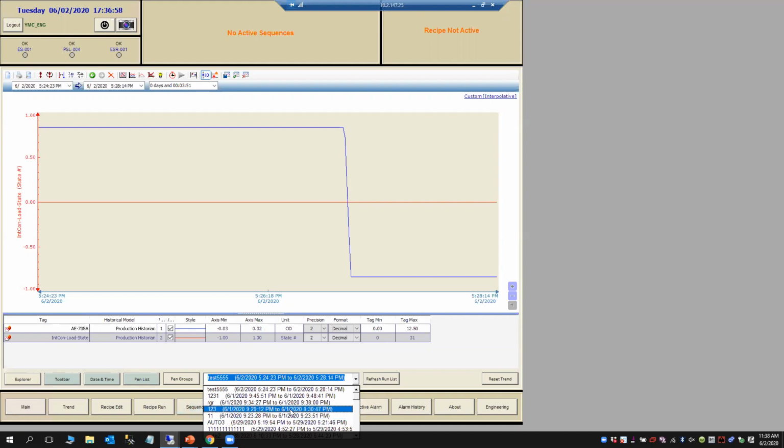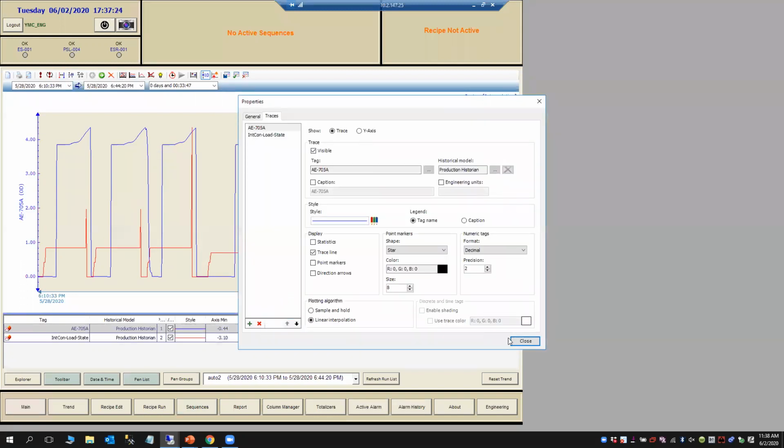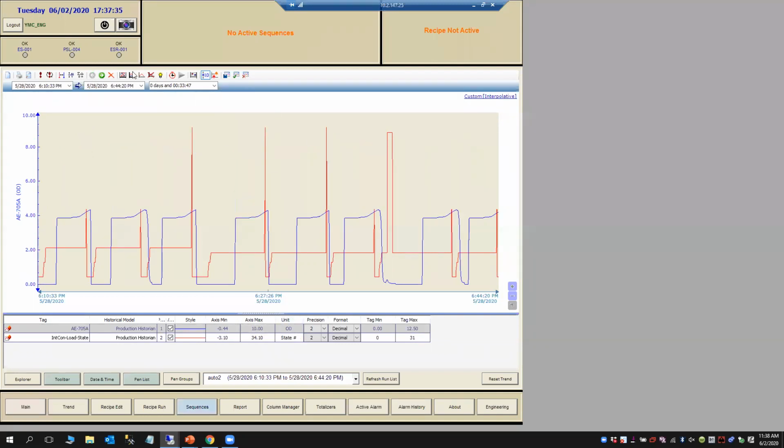And then let's scroll down a little bit and view another time frame. So here it is. And again, like every application, we provide you with a number of different tools that you can use. Just a few quick examples. You can, for example, select your trend trace editing. You can take your axis and you can update it like such. See how the screen changed.